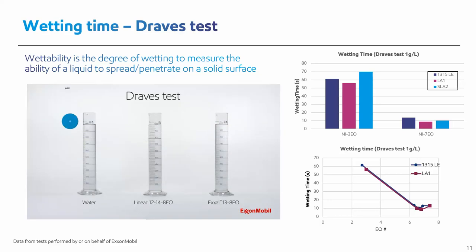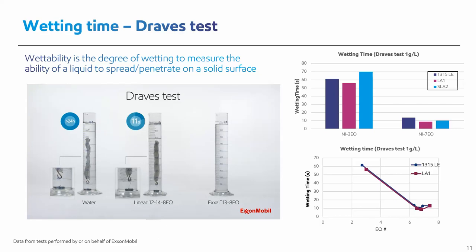A standard load is attached to a cotton thread and dropped into a surfactant solution. Timing begins when the weight touches the bottom of the cylinder and ends when the string becomes slack. Time is typically expressed in seconds.